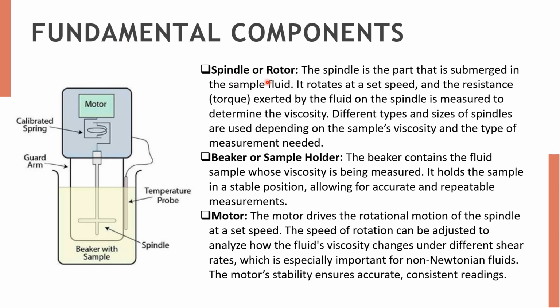Spindle or rotor. This spindle is the part that is submerged in the sample fluid. As I said earlier, this is the component which distinguishes the rotational viscometer from the rest of the viscometers. It rotates at a set speed and the resistance exerted by the fluid on the spindle is measured to determine the viscosity. There are different types and sizes of spindles which are used depending on the sample you are using and the type of measurement needed.